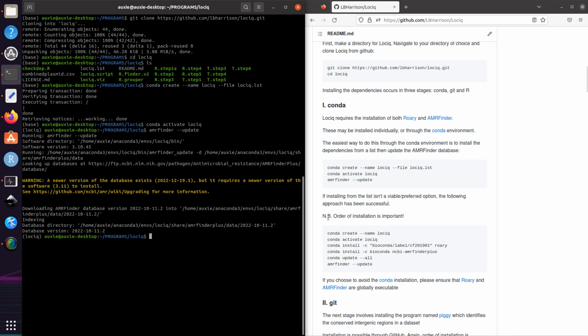Now, if you choose not to do the Conda installation, then you would execute this series of commands, but it is very important that you install them in this order just because of the conflict between Roary and AMR Finder Plus.